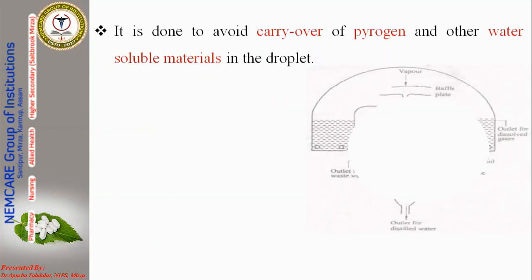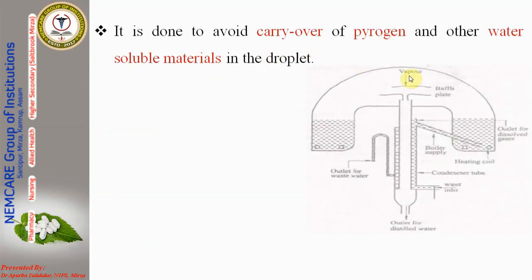Also, the baffle avoids the carryover of pyrogen and other water soluble material to the droplet, because the droplet will be separated here. If any kinds of pyrogens are there in the sample or in the water, that will be prevented by this baffle.